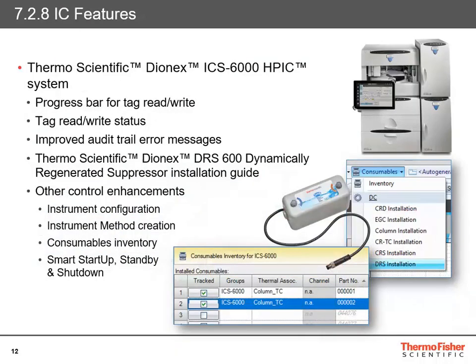There have been a number of new and improved features specifically for the Dionex ICS-6000 HPIC system. In the consumables inventory, there are several improvements: there is now a progress bar to indicate how much time is left for an ongoing tag read or write; two new table columns have been added — 'Last Write,' showing when tag information was last updated, and 'Status,' indicating a read, write, or read/write error. There are also improvements in error messages for tag read/write operations, where product part and serial numbers are now included to simplify identification of the affected consumable. Finally, a DRS-600 installation guide has been added to the consumables inventory.